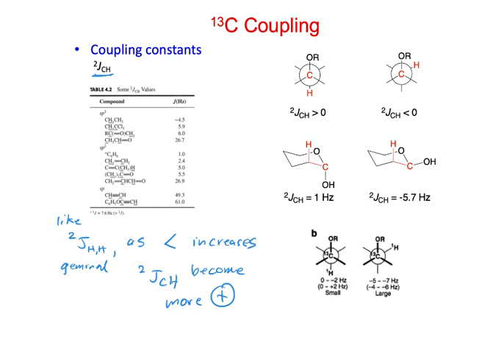So other places where this might play a role, if you do two-bond couplings, so some of these, again, are like sugars or acyclic compounds that have, some of them have alcohols. We'll look at a paper much later at the end of the course that does acyclic stereochemistry based upon various proton and proton C13 coupling constants.